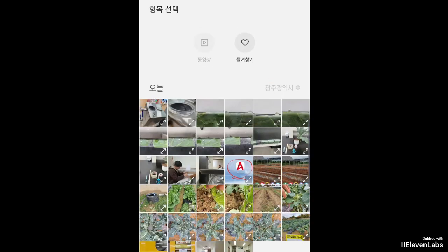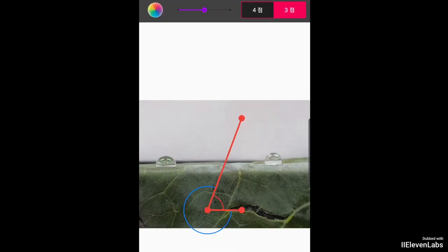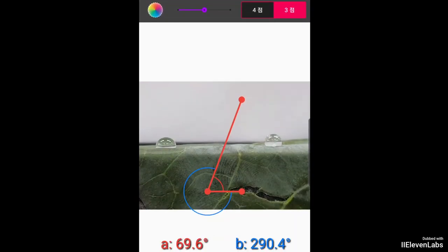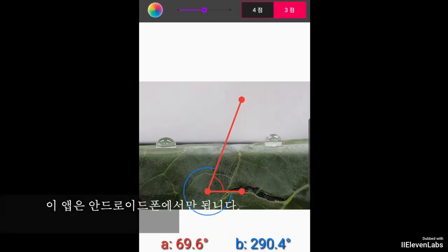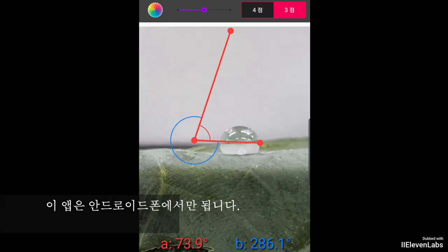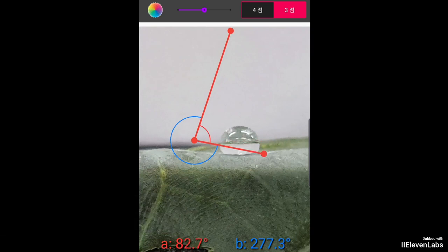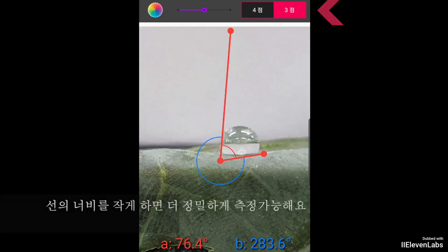Students can easily measure the contact angle of the water droplet in the photo they just took using the Angulus app for Android or Angle Meter 360 for iPhone. By adjusting three points on the screen to improve precision, reduce the line width for better accuracy.